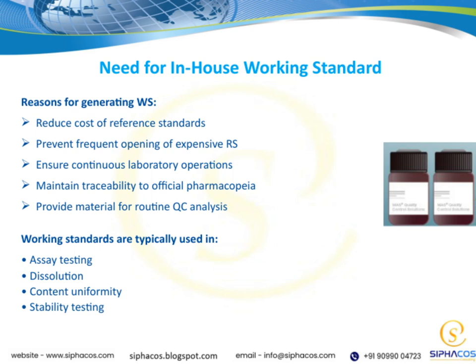Ensuring continuous laboratory operations is another key reason. When you have your own working standards, you don't have to wait for external supplies, which can cause delays. It also allows you to maintain traceability to official pharmacopoeia, ensuring your testing remains compliant with regulatory standards.